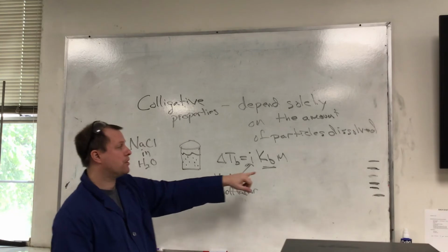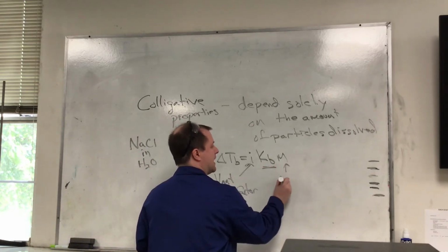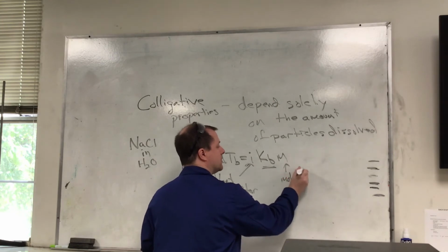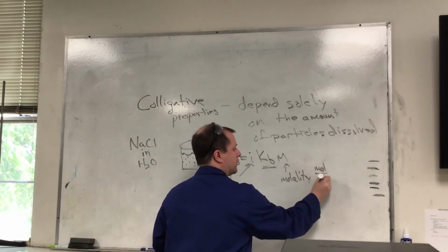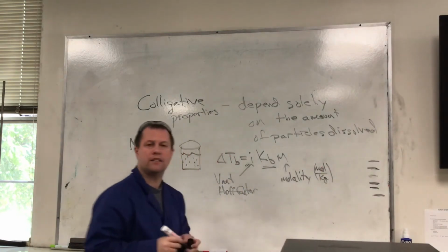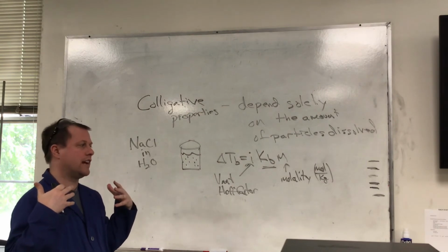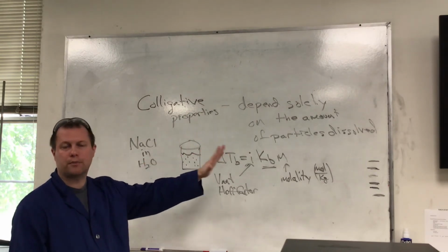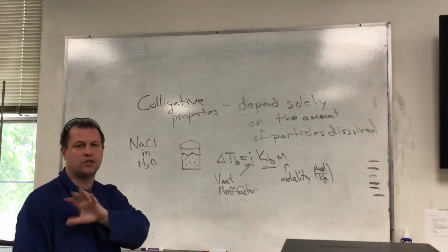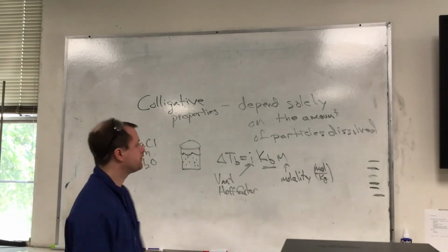All right, now the last part of this equation, this lowercase m, is molality. So we'll highlight this here. This is not mass, this is molality. We're talking about moles of our solute per kilogram of the solvent, unit-wise. That will be important when we get to the very end of our calculation and we're trying to find the molar mass of urea, which is the last thing I'm going to show from a conceptual side, and then I'll show the experiment setup, what things look like and what we're hopefully going to be looking for.